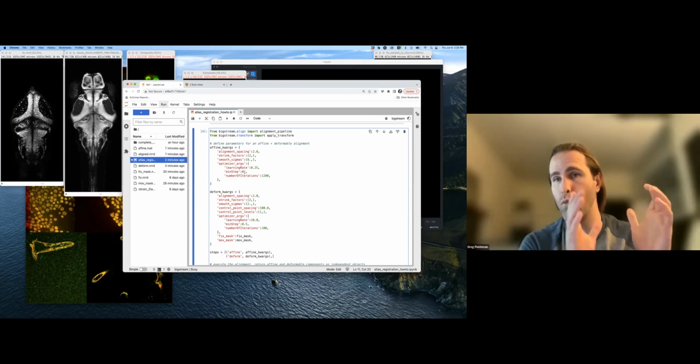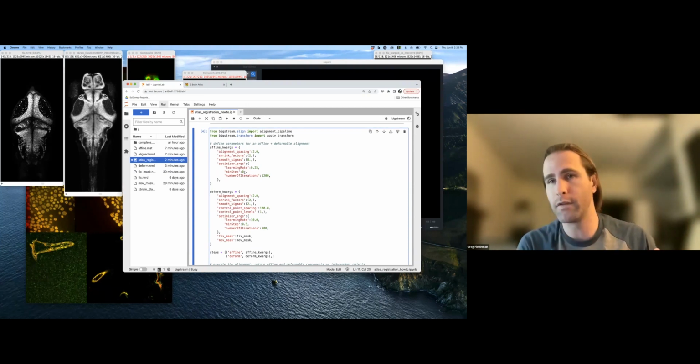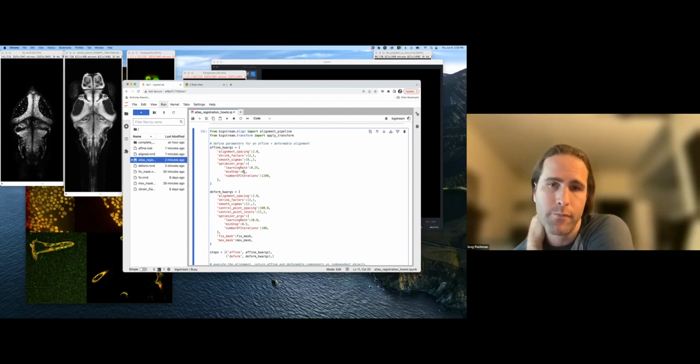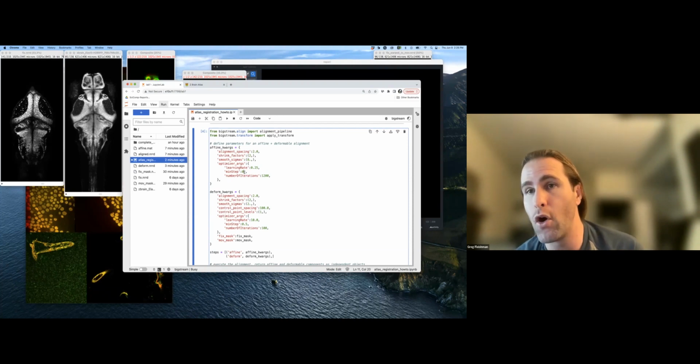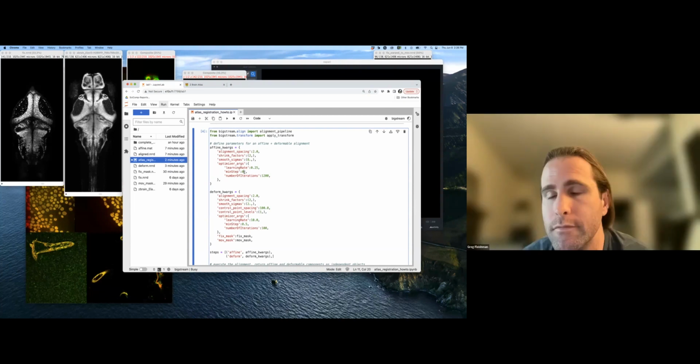You can move the labels onto one of your time point subject data. And then because you have tracking, you can move those labels along the time axis between different acquisitions. That to me seems, if it can be done, my preferred strategy. And we do that with our zebrafish data for calcium imaging. We usually do motion correction and stabilization in the time domain for the functional imaging data, and then register only one time point to the atlas.